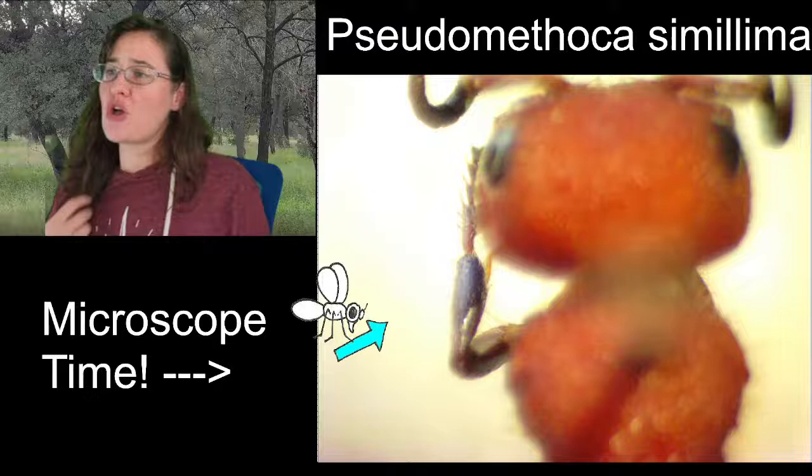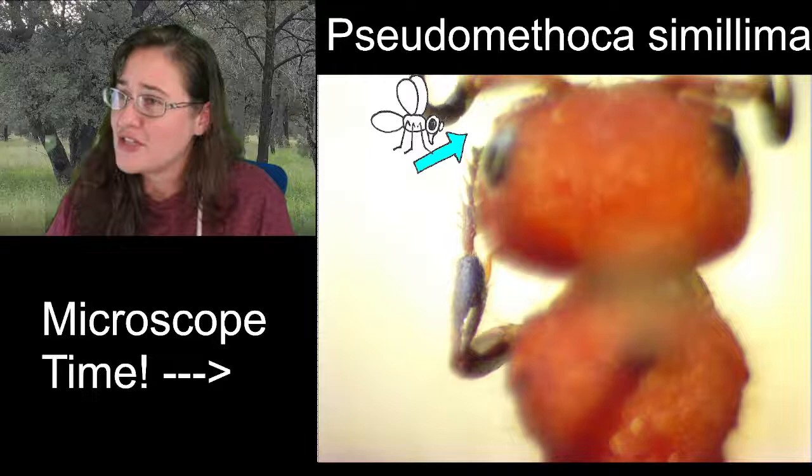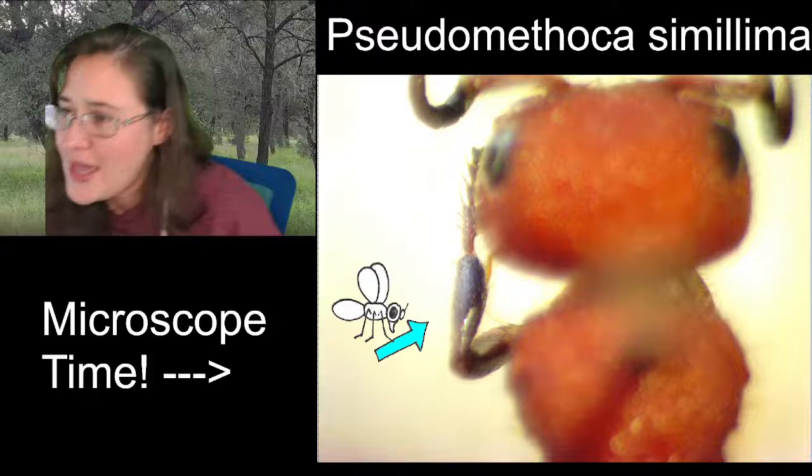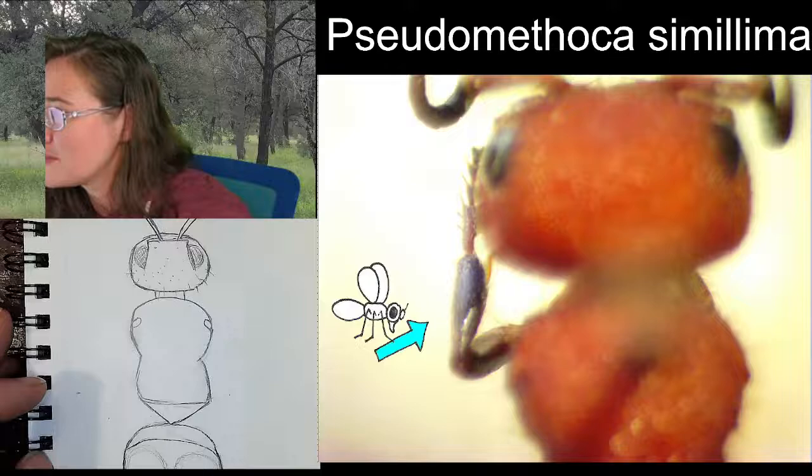It looks like my last tarsal segment on this leg got knocked off. You can draw the rest of the leg and then skip the last one, so you can see what the middle and hind ones look like — they're going to be very similar. Sorry about that — we don't mean to break our specimens.